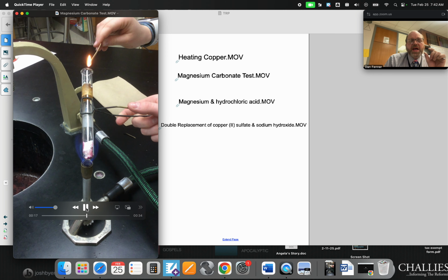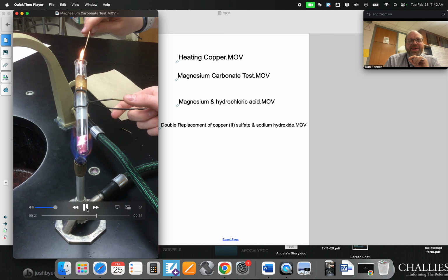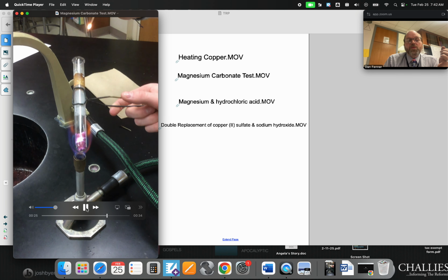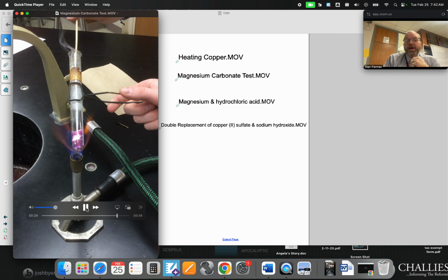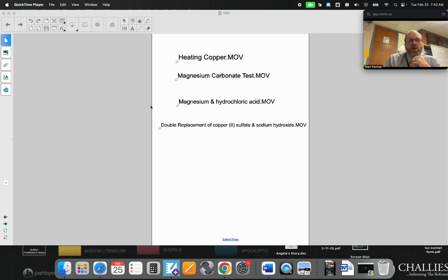When it goes inside, what happens to the flame? There you go, the flame goes out. Now, when it comes back out, because it has enough oxygen, it reburns. The carbon dioxide puts it out. That's the reaction there.